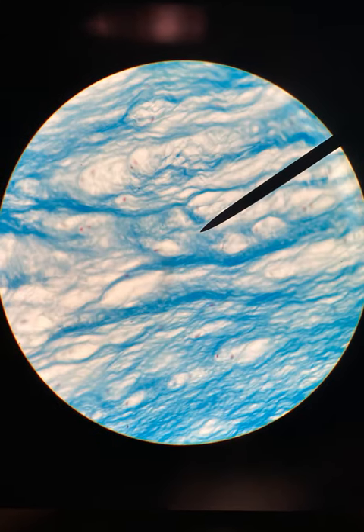Here we have a type of connective tissue that is a cartilage connective tissue, and this is fibrocartilage. And fibrocartilage's function is to resist compressive force within the body. So it's going to be found in the pubic symphysis, along with other areas in the body that need to be able to resist compressive force. And you will see that it's kind of wispy.